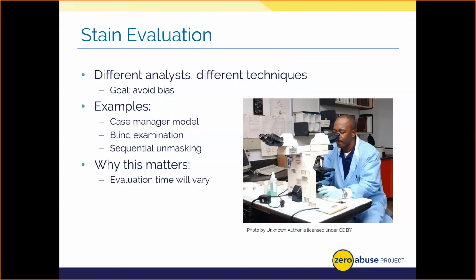Next, let's go ahead and talk about a blind examination. Some analysts totally avoid all details and go in devoid of case information, only looking for stains and processing them based on their training in visualization, serology, and DNA, without information that provides context to inform them about where to look or what to look for from a serological perspective.